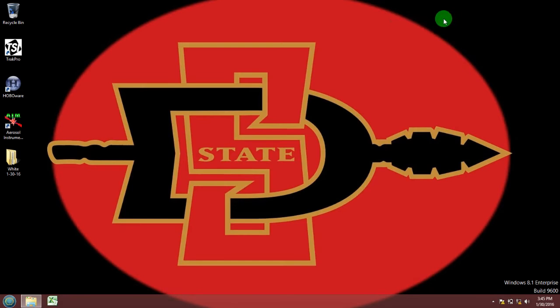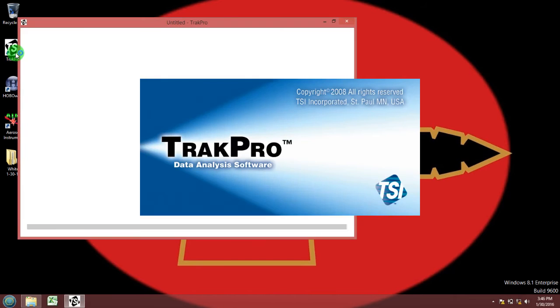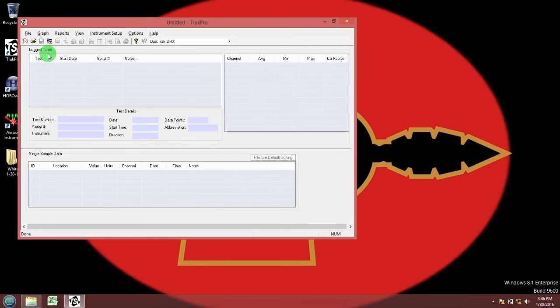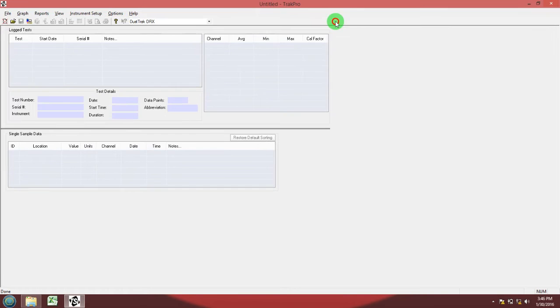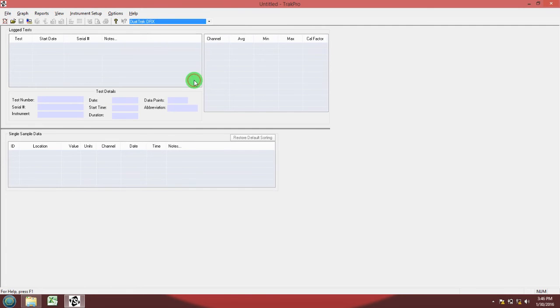Now I'll go ahead and close that up. Go to TRACK PRO SOFTWARE. The software works with multiple devices so make sure you select the correct device, which in this case is DustTrack DRX.